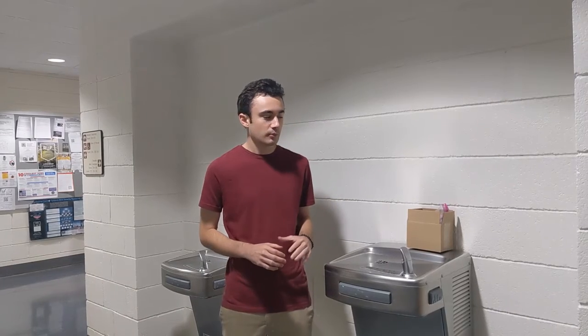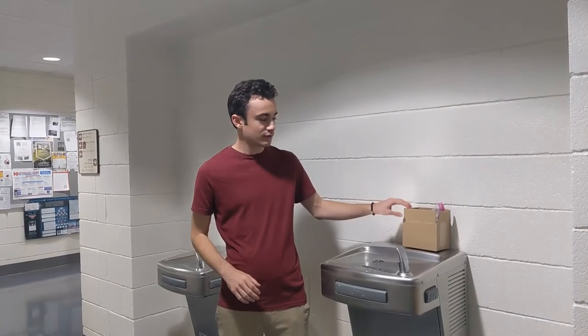After taking all of the samples at your facility, place all of the bottles into their individual boxes and place all the boxes into the one in which you received them. You'll have a return label, which you should attach to the box and return it to a drop-off facility.